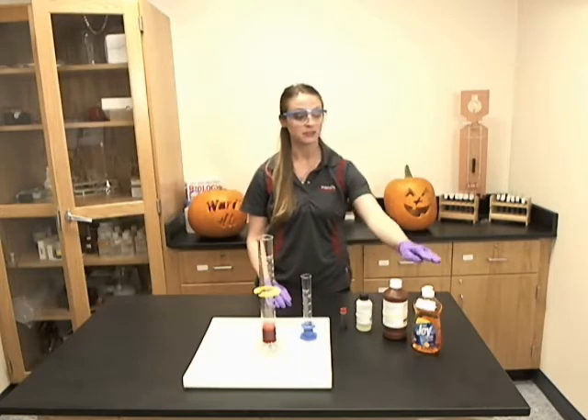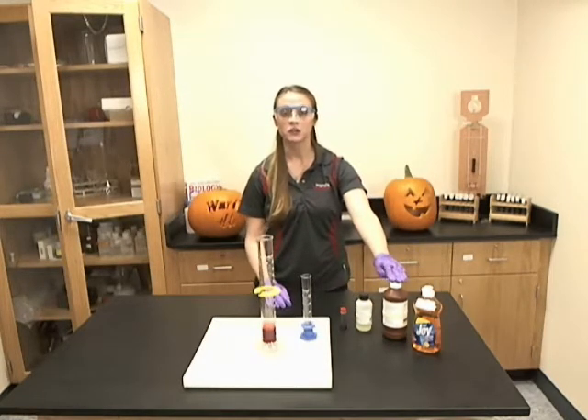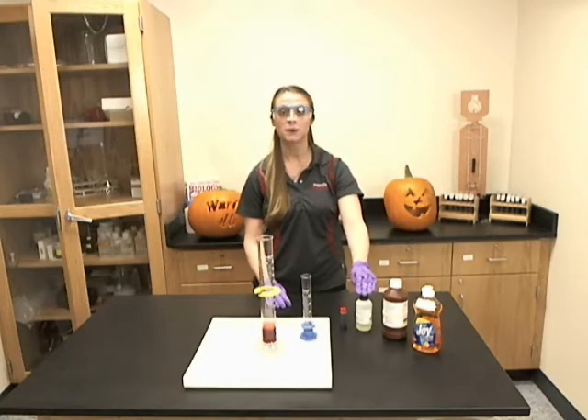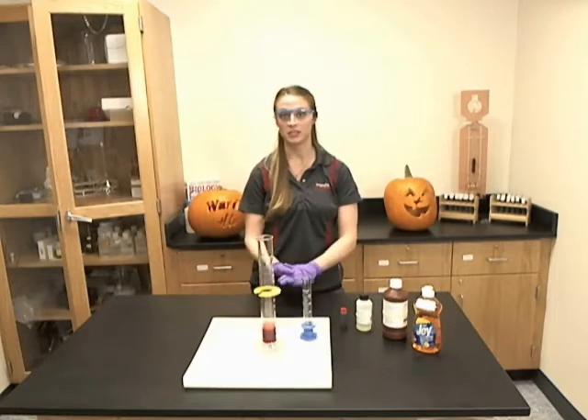With this kit you will receive dishwashing detergent, hydrogen peroxide 30%, 2 molar potassium iodide, and food coloring along with the instructions.